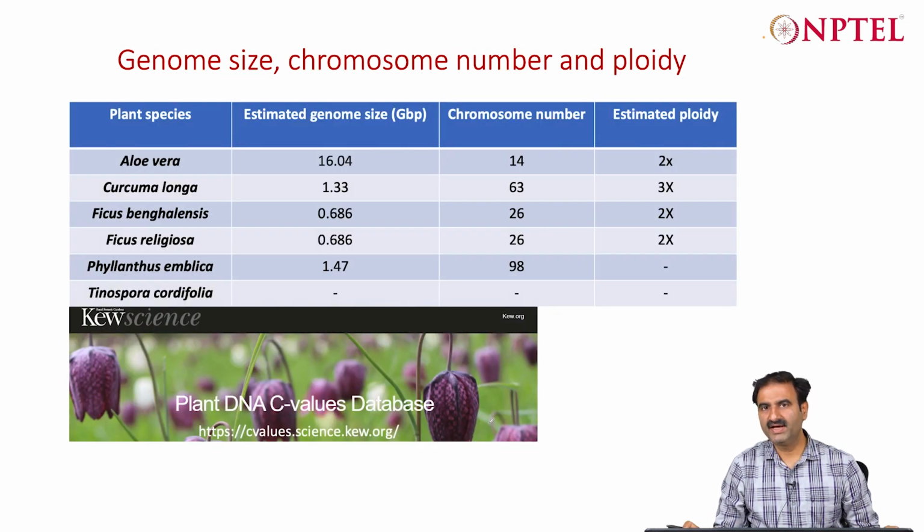Okay, and basically there also, the sample that you have got should be in plenty, so that you can keep it for later use, after doing the initial DNA RNA extraction and completing your work. Even after the manuscript is submitted, you should have some sample kept with you, stored with you in appropriate conditions, so that you can use it later for any kind of validation or reconfirmation, or any other method that you want to use in the future.